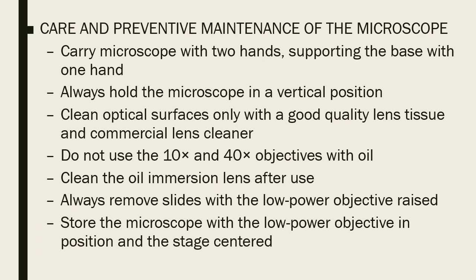Also, do not use eye mascara when you are utilizing the microscope, because it might damage the lens of your eyepiece.